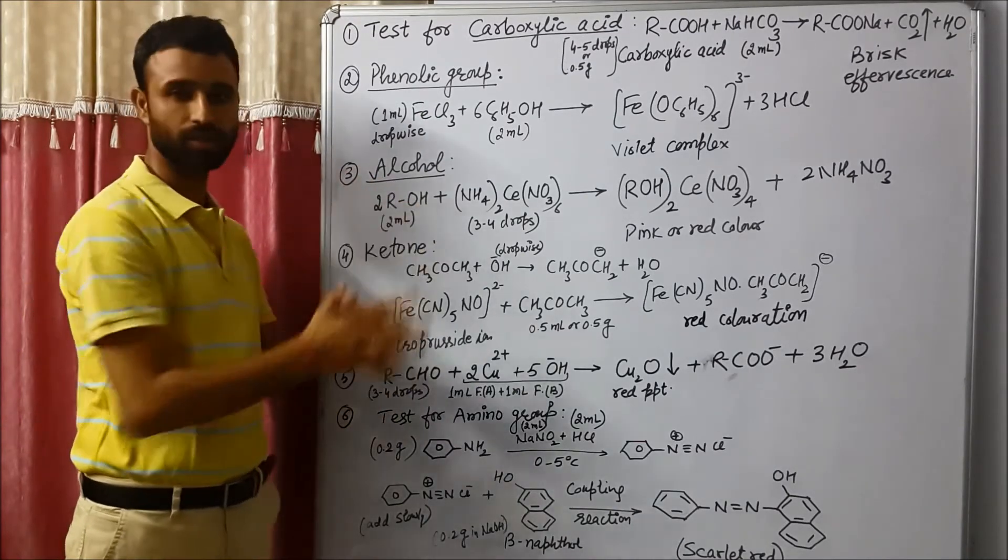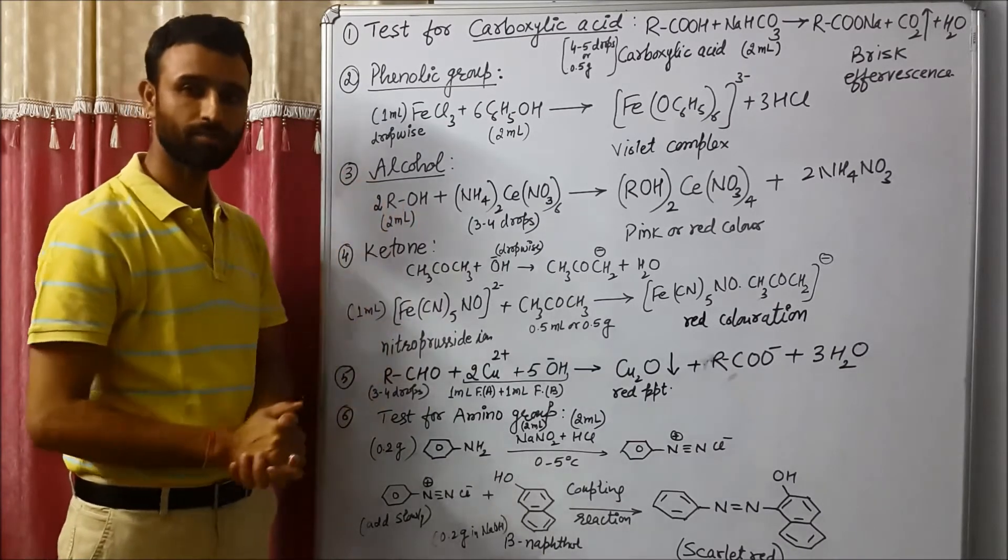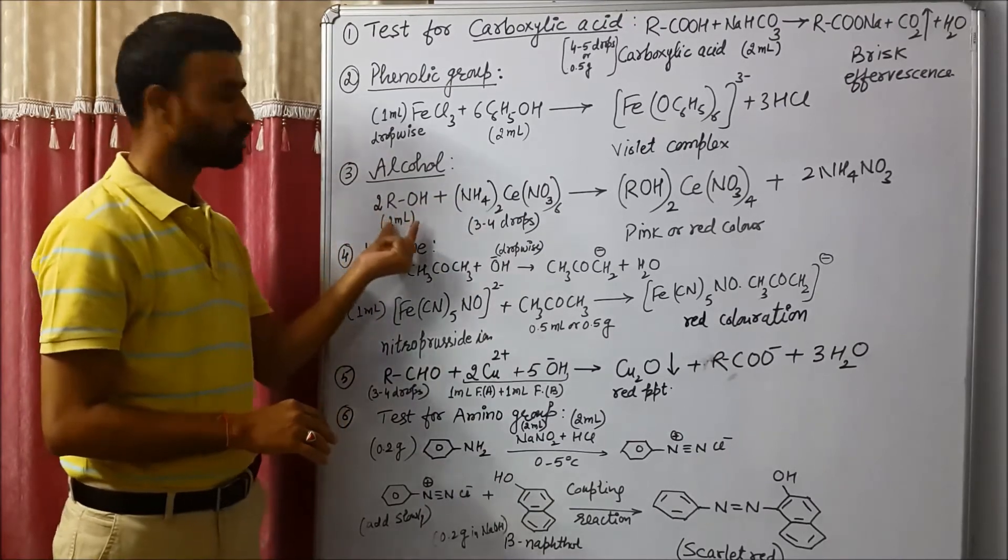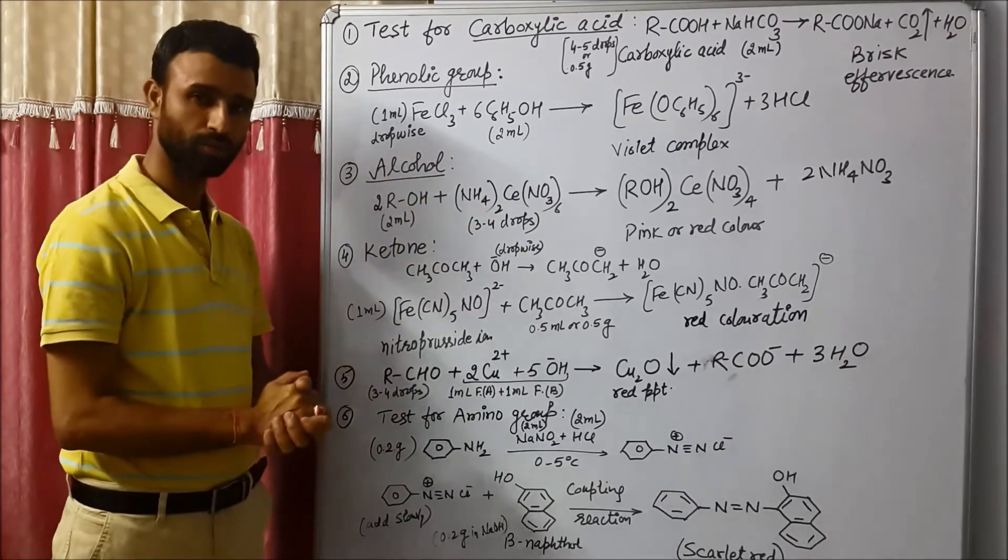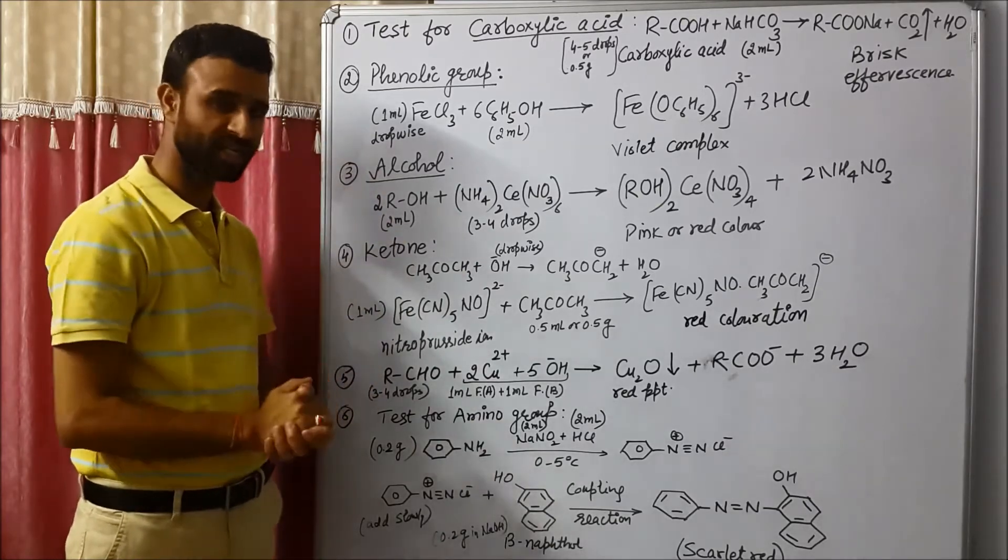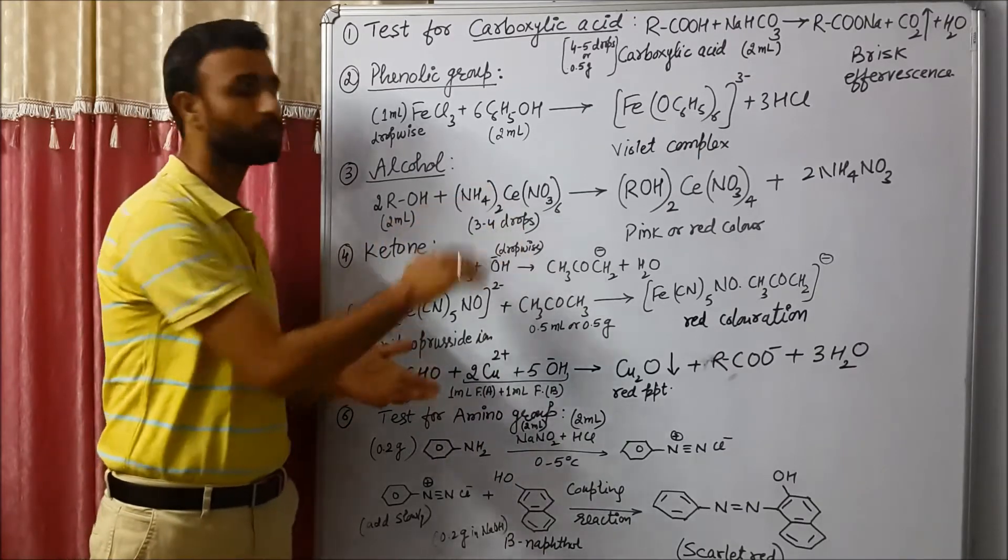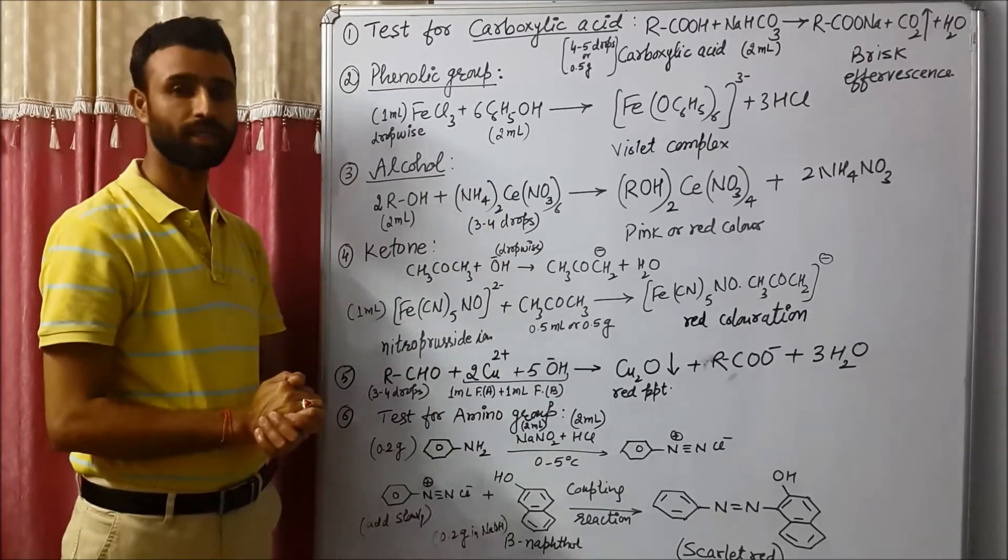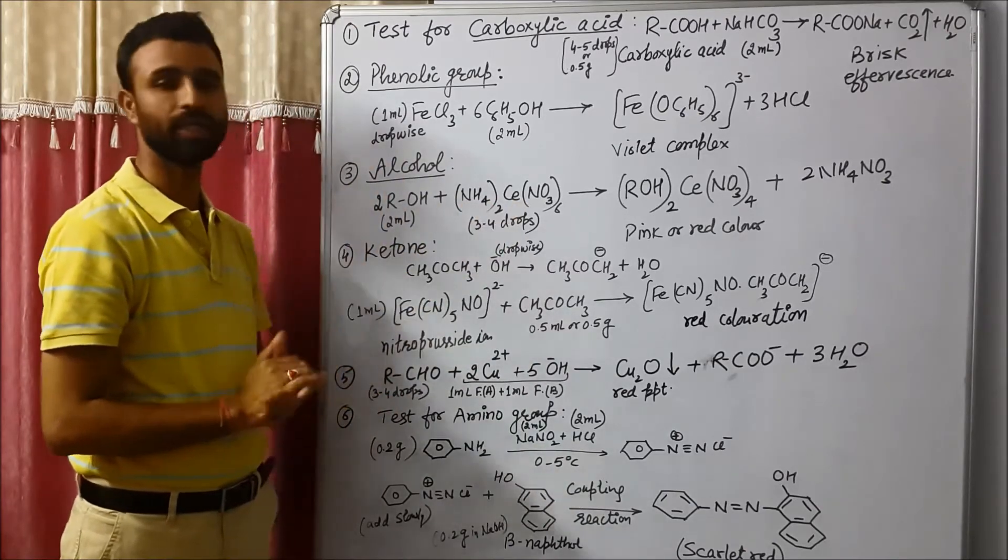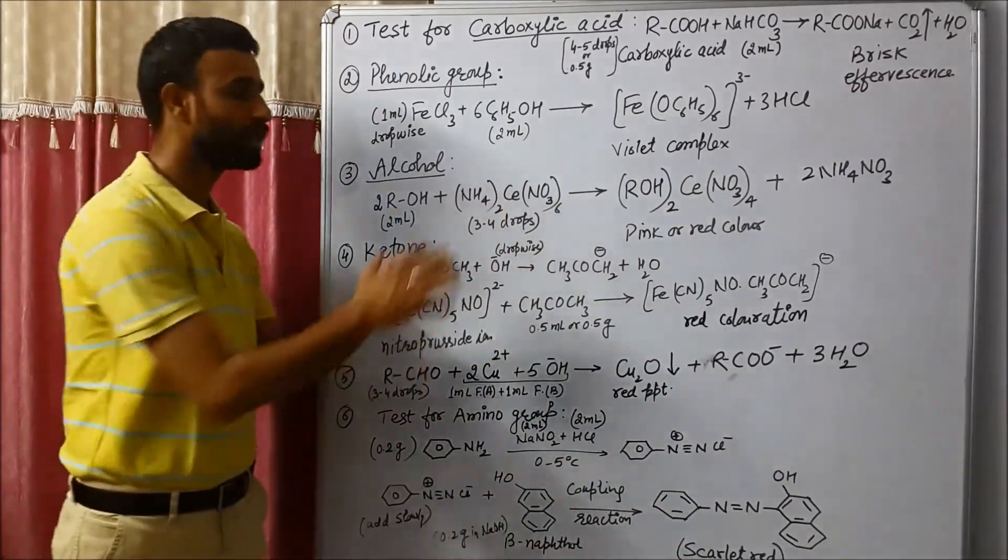Then come to the next, that is alcoholic group. Now take organic compound. We have this organic compound. Let us take alcohol compound is there. So 2 ml take in dry test tube. Add 3 to 4 drops of ceric ammonium nitrate. As we add 3 to 4 drops of ceric ammonium nitrate, we see pink or red color complex. If it is formed, that means alcohol is present.